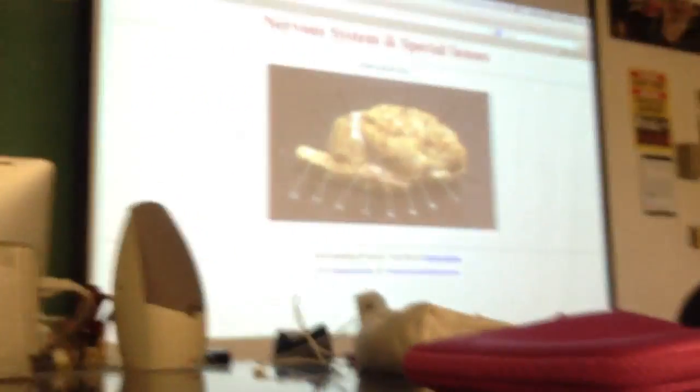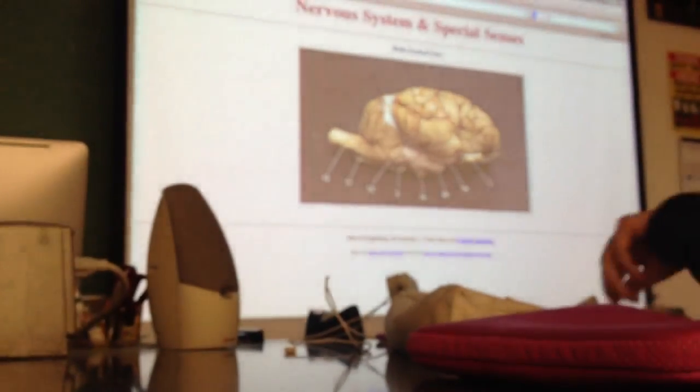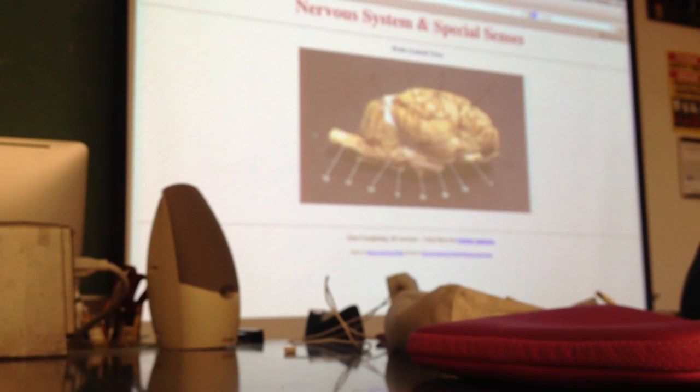Move on to the olfactory bulb. The olfactory bulb will be found up against the inferior side of the frontal lobe, and you'll see that the nerves are this white color, okay? So the rest of the brain is almost a yellowish color, whereas the nerves are much more white, okay? You can see nerves down here as well.